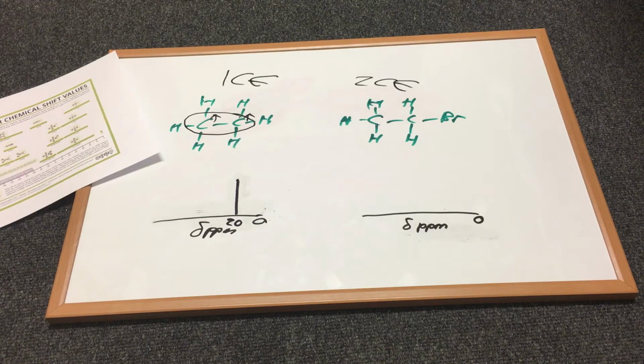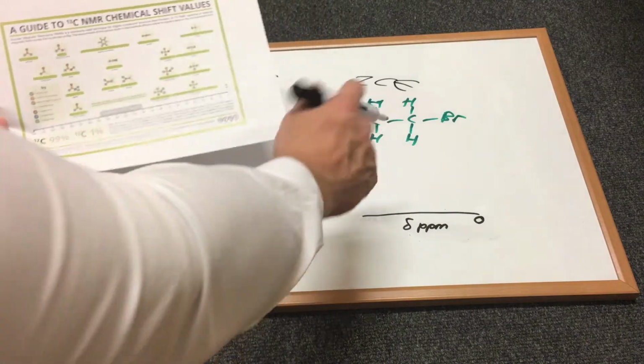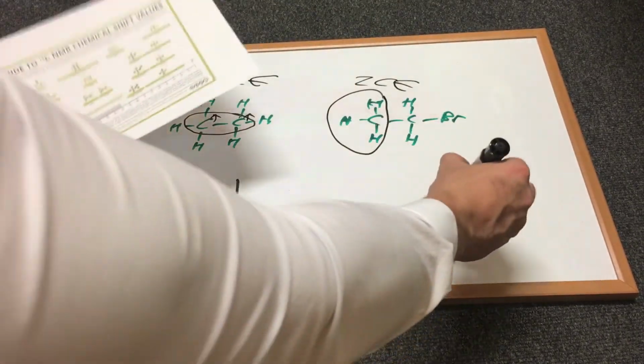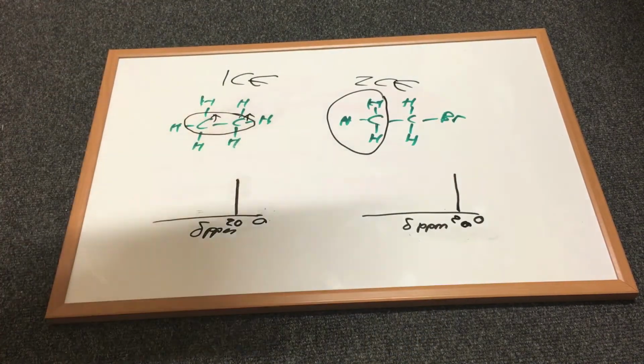So looking at the spectra for bromoethane, you can expect to see 2 peaks. 2 different carbon environments are equivalent to 2 different peaks on the spectra. So then, same as last time, we refer to the guide, and we've got an alkyl group, which is going to be a similar position to this. So, place that about 20. This is a rough estimate, the figures, but it's within the region.